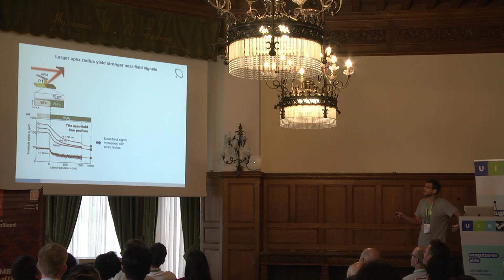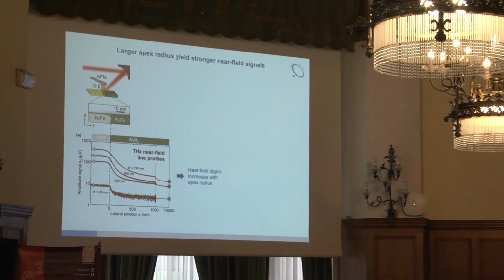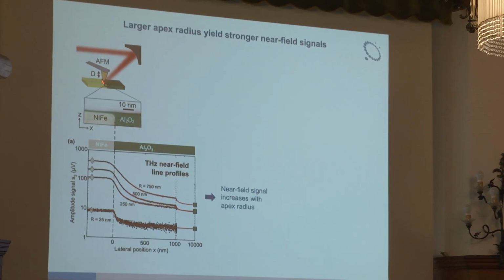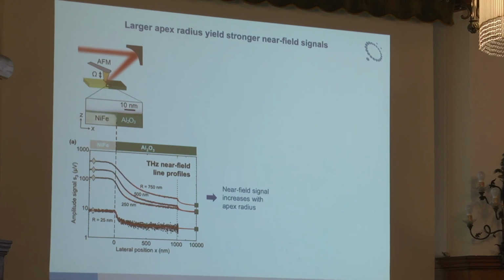So that's a little bit more quantitative. What we did here is an experiment: we scanned across a very specific test sample. It's a kind of topography-free sample, actually from the reading head of a hard disk. This is a TEM cross-section. I remember when I was a PhD student, there were even people doing PhD theses on fabricating topography-free samples to make artifact-free line scans. Here you just crash the hard disk and take it out. It works very nicely. That's metal and that's dielectric, and we scan over this, and there's no edge darkening artifact and nothing.